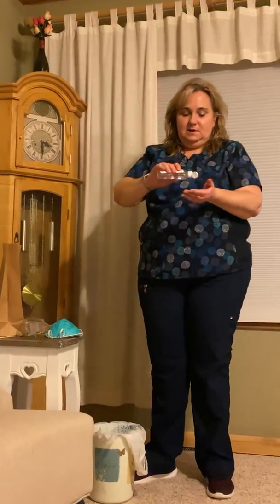Okay, so each time I put the mask back on, I need to make sure I have those gloves on. And each time I take the mask off, I should have those gloves on, because if I take the mask off with my bare hands, then touch that mask on the outside, I can be contaminating my hands. So then I would use either hand sanitizer or go wash my hands with soap and water. If your hands are visibly soiled, if you can see that they're dirty, you need soap and water, and hand sanitizer is not adequate at all.